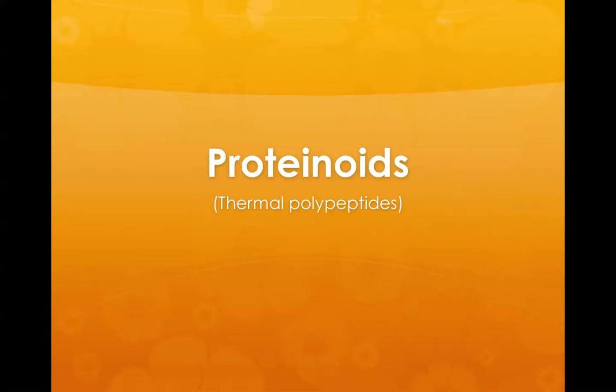One of my areas of research is the synthesis of so-called proteinoids. These were first produced, synthesized, and characterized by the late biochemistry professor Sidney Fox in the 1950s as part of a program to explore and understand prebiotic chemistry. The technology is such that these thermal polypeptides are produced by simply heating selected amino acids up to a high enough temperature, causing polymerization, polyamide or synthetic peptide bond formation.